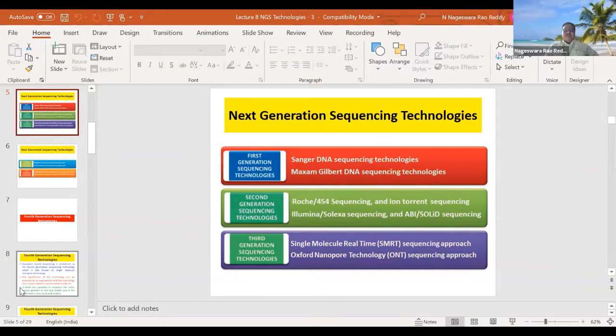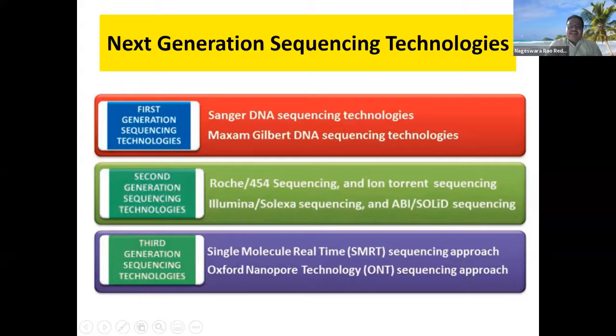Okay, and we've seen what is there in nanopore technology. Coming to nanopore technology, we have seen that the DNA sequence will first be separated into two, the template read and the complement read. Then one sequence will be taken and passed through the nanopore. Once that is passing through the nanopore, an ion fluctuation will be generated, and that ion fluctuation is equivalent to the voltage, and that is recorded as one nucleotide.